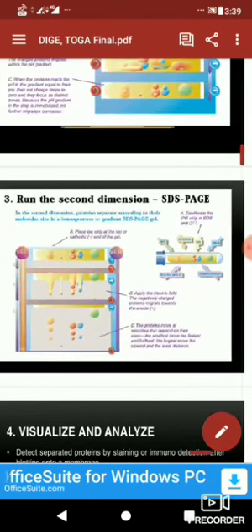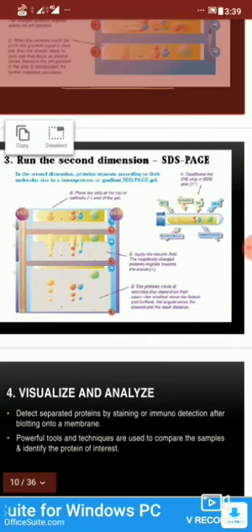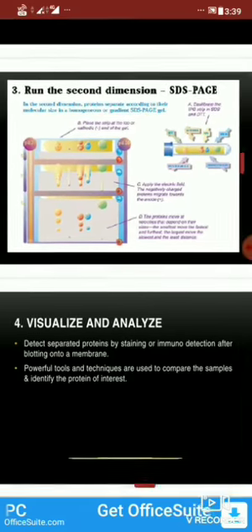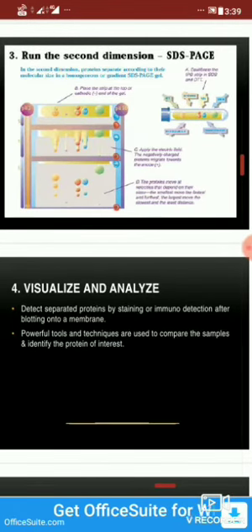Once it is placed, we run a normal SDS PAGE.